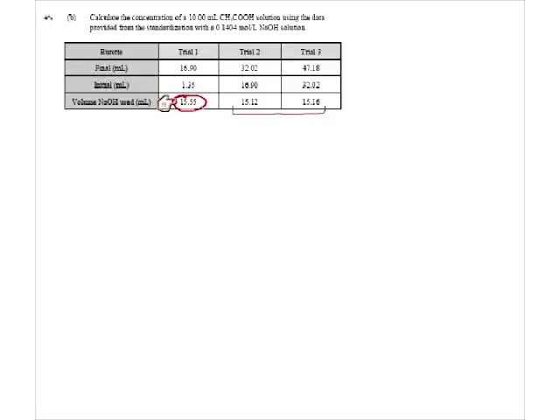Okay, not bad. But generally the first one is a fact-finding mission. You're trying to find your range. It's like throwing darts or horseshoes. The first one is usually way out to lunch, and you say, well, okay, now I know where I've got to throw it. So you would omit the first trial and say that's only a trial run, and what you're trying to do is get 2 readings. So this is trial number 2 and number 3. You want to get 2 of these that agree within plus or minus 0.1 of a milliliter.